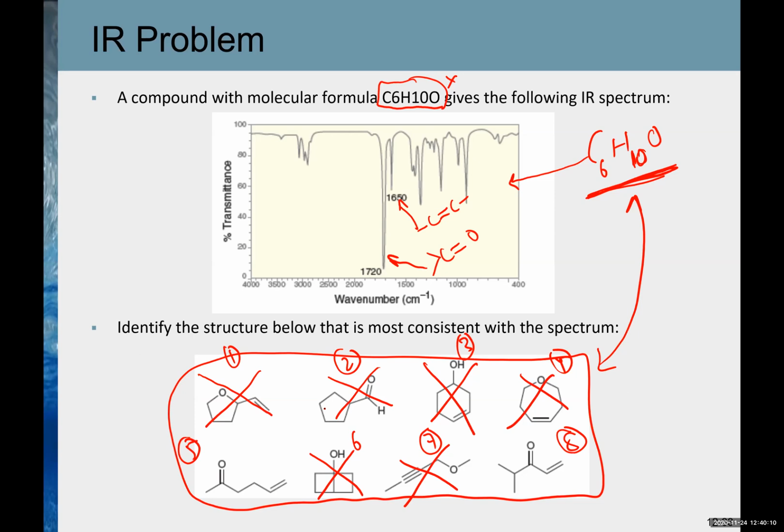It'd be 5 because there's only one CH3 and the CH3 peak's not that intense. So you base your decision on what peak? Would it be 5 because of CH3, the CH2 peaks? Okay. 5 is correct, and you may be correct in that case also, that there are more CH3s.